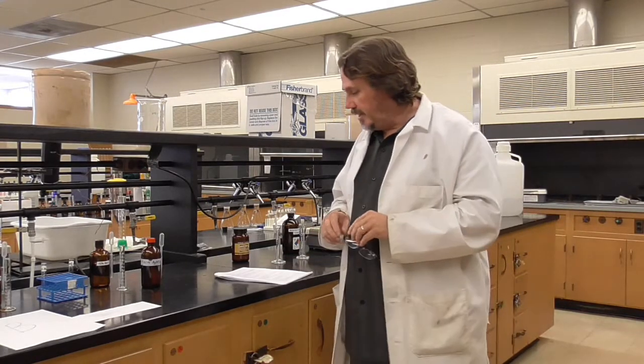Okay. All right, so part B, tests for chloride, glucose, and starch. These tests we need to understand what they look like and how to properly interpret them so that we can get to part C and actually look at the dialysis and osmosis part of this lab. So part B is just learning the tests, learning what it means to have a positive or a negative result for those three things that we'll be looking at in part C.